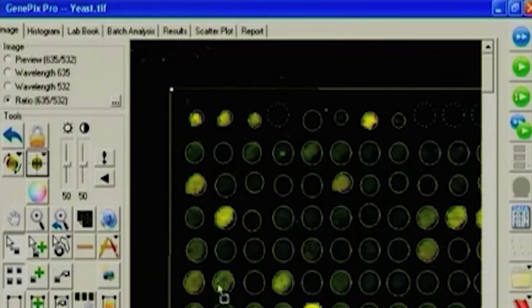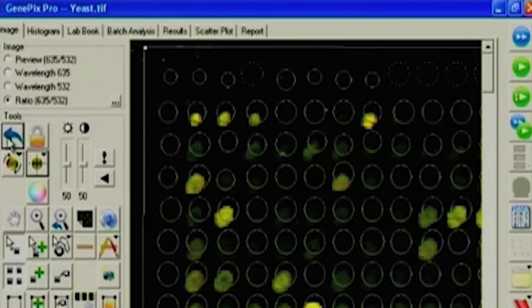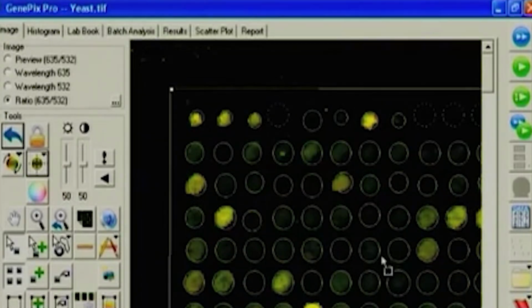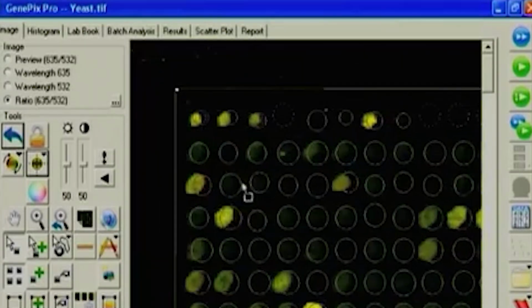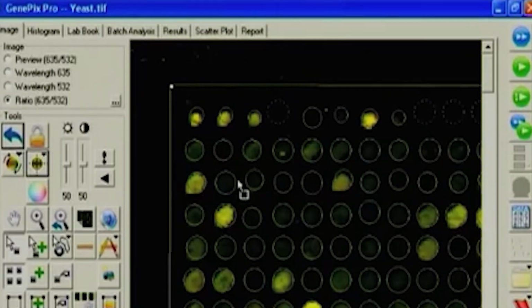One thing which is good here is that it automatically adjusts according to the spot size. The overall width adjusts accordingly, since some spots are not so uniform, so it makes that correction here. You can actually move it, but it doesn't affect anything as long as you have kept it once and the data is being stored. But usually people ask me, is it a good idea to do it once again if I happen to move it? It's not a bad idea, because it takes only a few seconds.